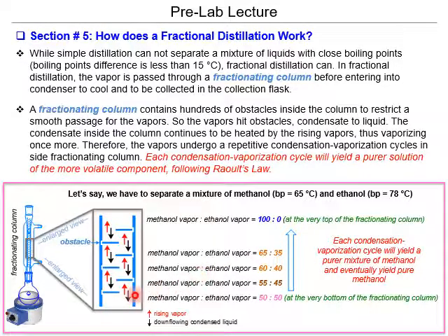There's several problems though with fractional distillation. Sometimes the vapors can get stuck in the downside of each platform. You can read about it in your book, but there's of course ways to circumvent those inefficiencies.